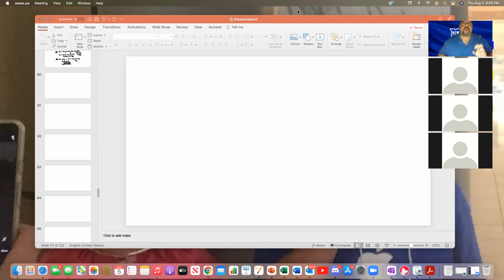Now, what would happen if you add a third component? In test tube B, the third component is benzoic acid. In test tube C, I believe the third component is resorcinol. And the idea is, does inhibition occur? You don't have to distinguish what type of inhibition it is, but do the benzoic acid and the resorcinol prevent the tyrosinase from working as it really should? That's the key idea in this part.